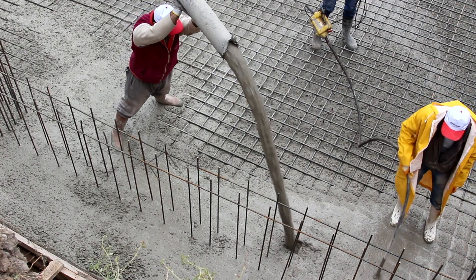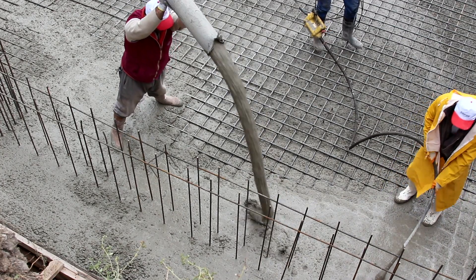Hello and welcome to the ElvaTech YouTube channel. Today we will talk about an important topic in the construction industry – cement analysis. Cement is a key material in construction and its quality plays a crucial role in the strength and durability of buildings.